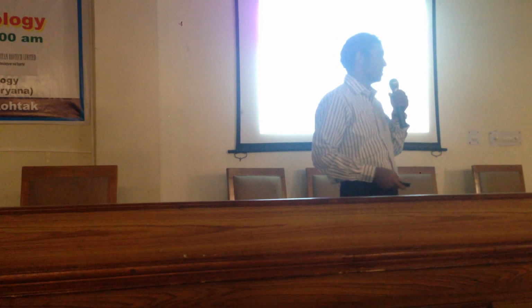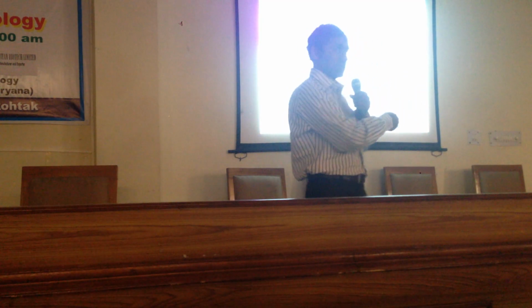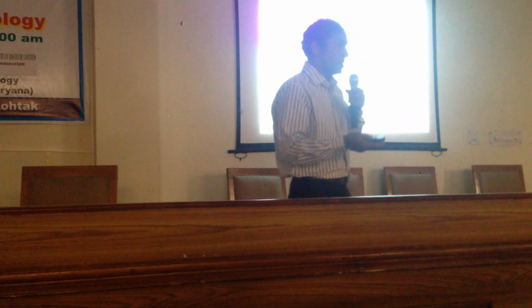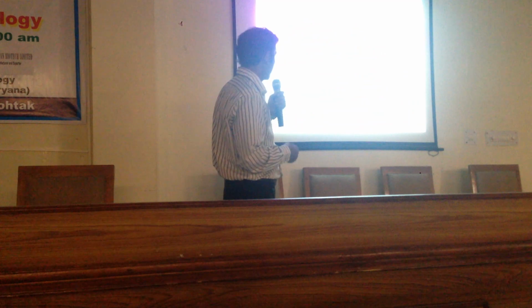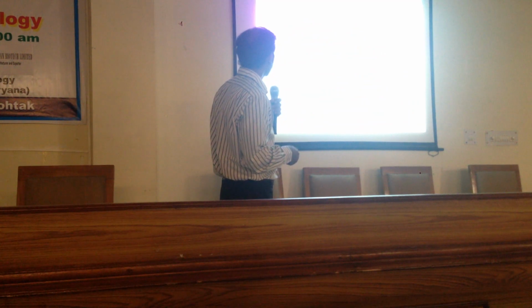So that was Maxam and Gilbert. But Sanger's method is still being used in more advanced form, and we will discuss that in some detail.